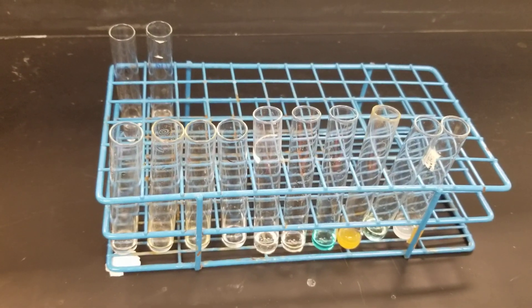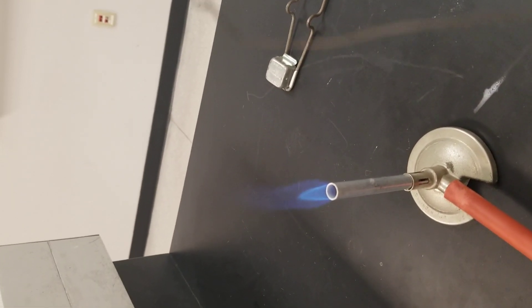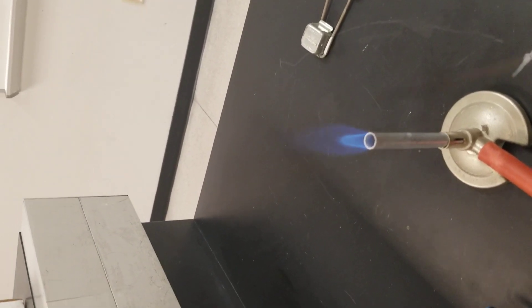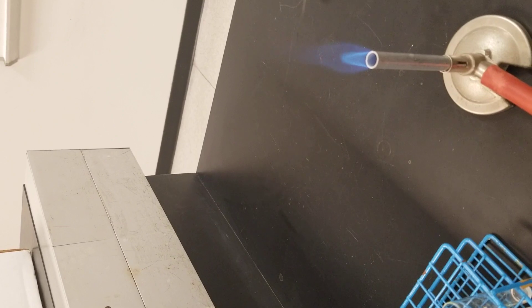This is the flame test wire with the loop. We have to make sure the flame test wire is clean before starting the experiment or before recording the color of the metal.